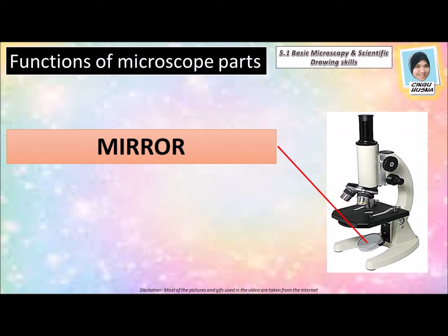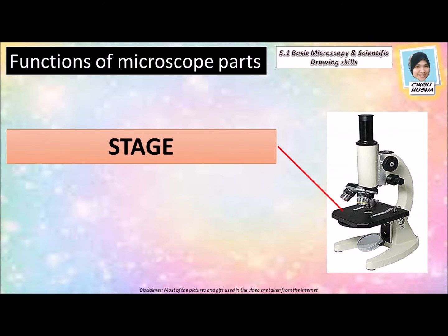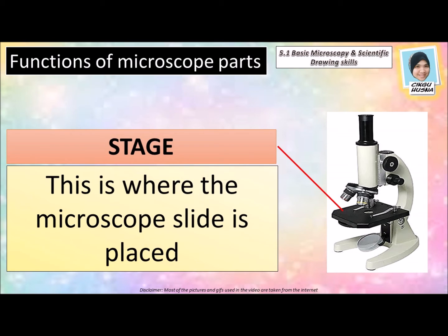The mirror. The mirror of the microscope reflects light into the microscope. Stage. This is where the microscope slide is placed.